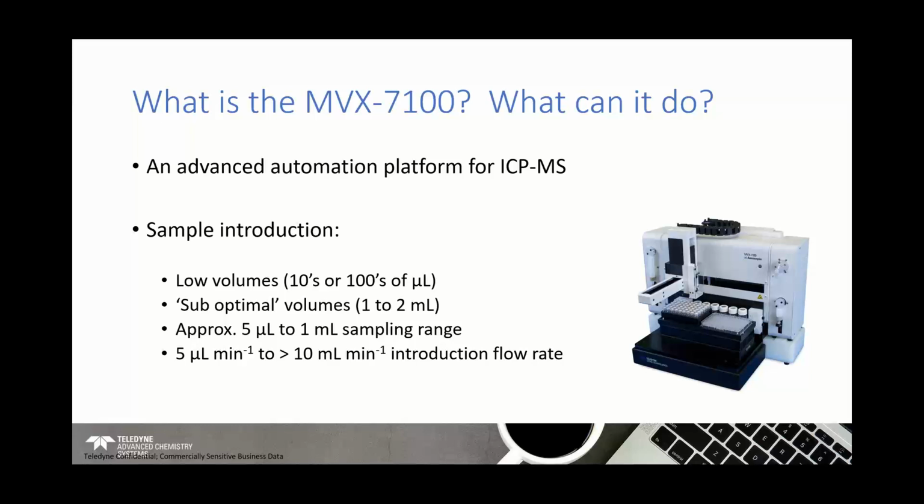Normally you would use this system for the introduction of tens or hundreds of microliters of sample, or slightly higher. What I call suboptimal is a situation where you don't quite have enough sample to operate with a peristaltic pump approach, or a natural aspiration approach, for example.